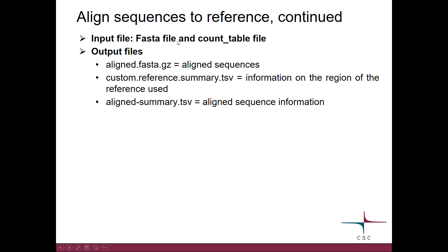As input you need to give the FASTA file and the count table file. As output you get the aligned sequences and two summary files. One is for the reference, telling about the region that you selected to use, and the other summary file tells about your own sequences in the alignment.